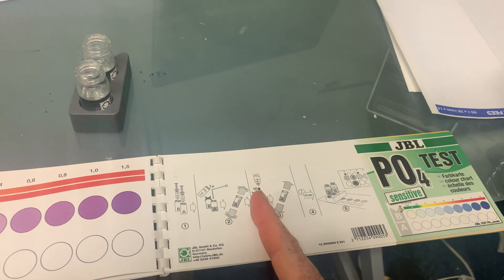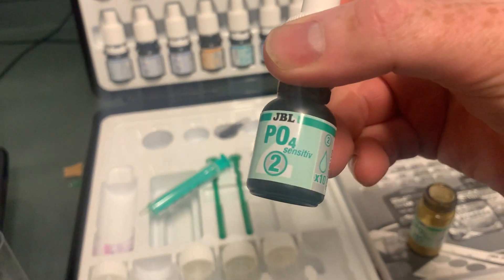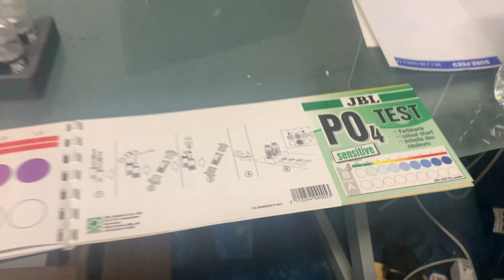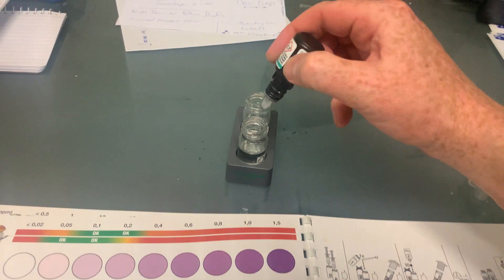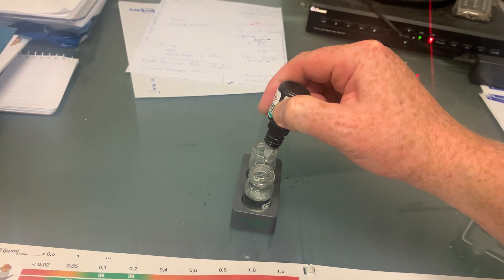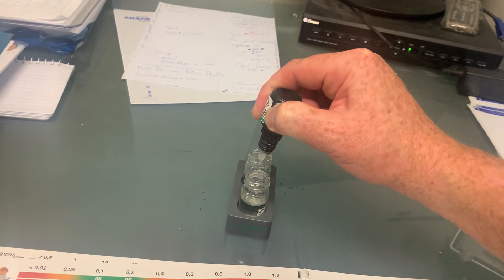Now after shaking, I'm going to get reagent number two and put in 10 drops. So there's number two — 10 drops. I'll just count those out: 1, 2, 3, 4, 5, 6, 7, 8, 9, 10.